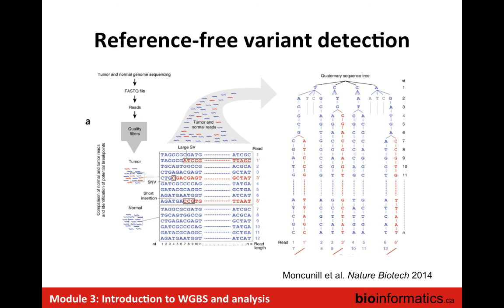So, for instance, here this is relative to a variant. You're detecting a whole bunch of reads that have two versions, one with a variant, one without. And then you would do the step of knowing where it goes in the genome as a secondary step. In a way, you would also probably map it to the genome to know what it's doing. Yeah? Probably create contigs, so your reads are longer and you know exactly where.